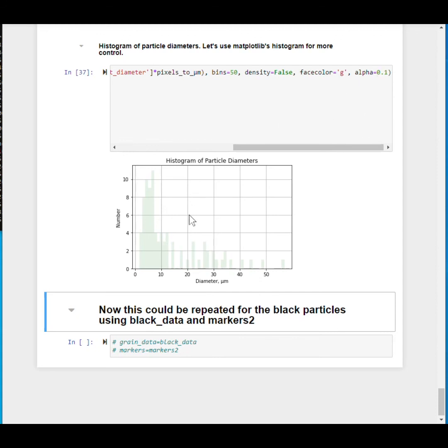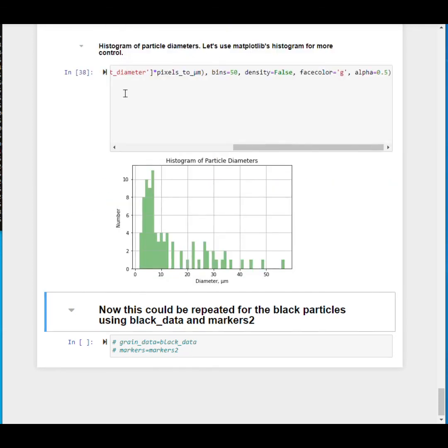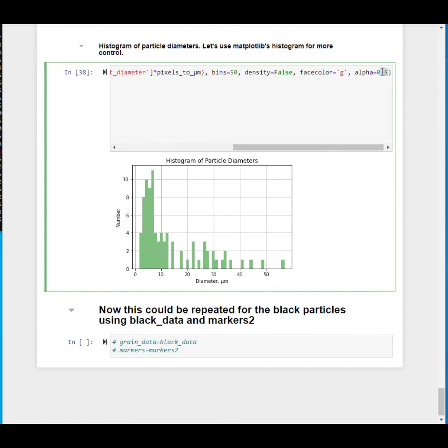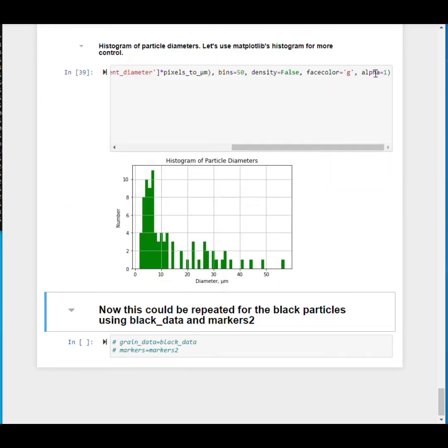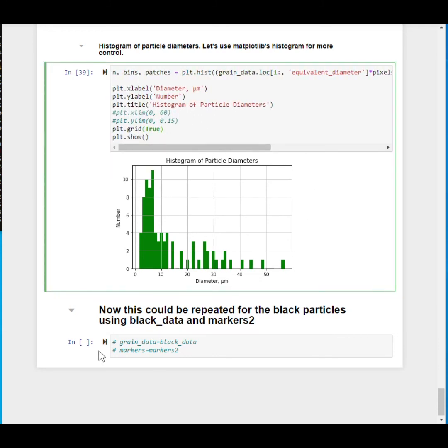But you can see this is like an opacity. So this really pushes it far into the background. You could start to see here. Now you could still see the gray through here, but it gets darker and darker as you move your alpha value up. And there's 1. All right, so some sort of a blending value.